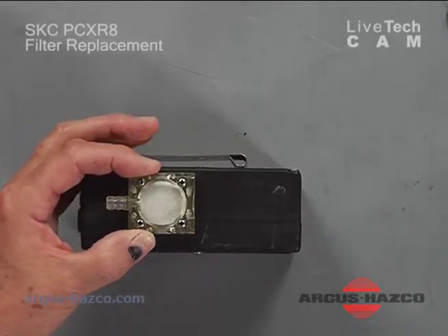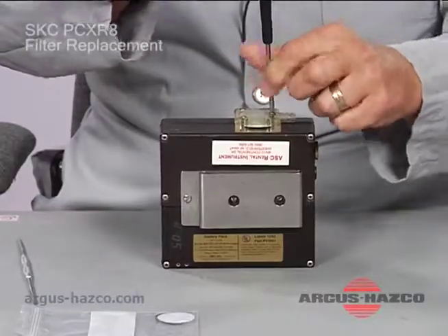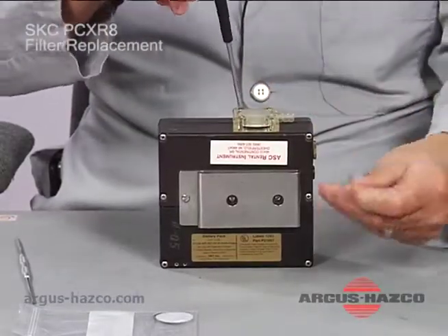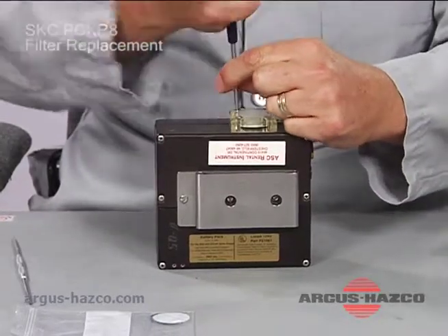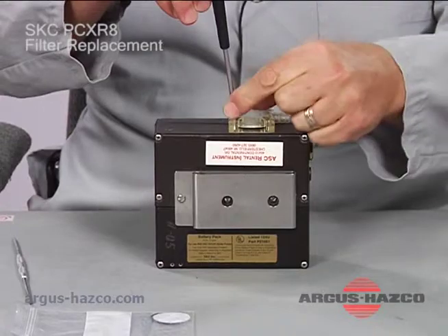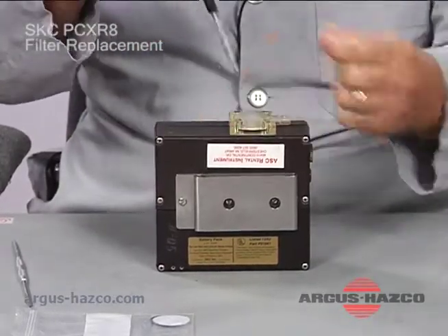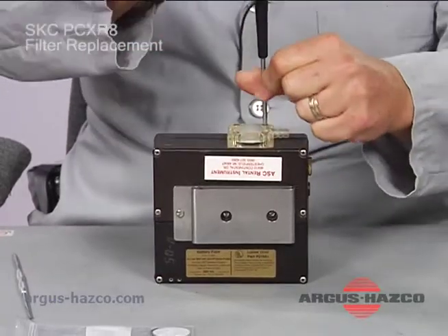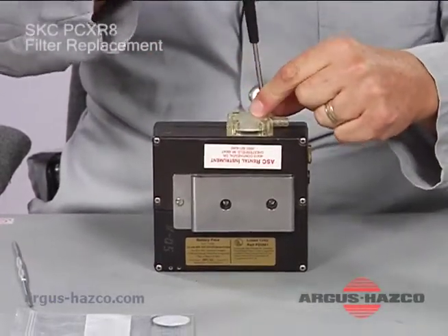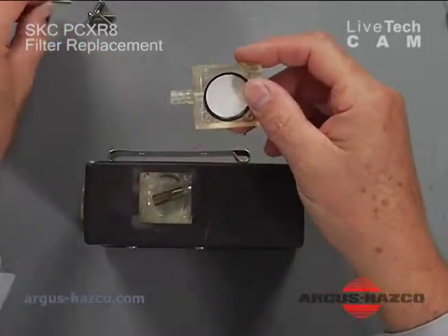There are four Phillips screws that hold the filter in the filter housing. You will remove all four screws and then remove the top half of the housing.